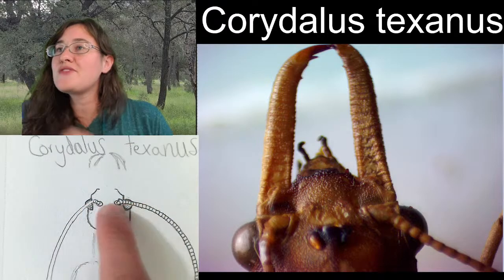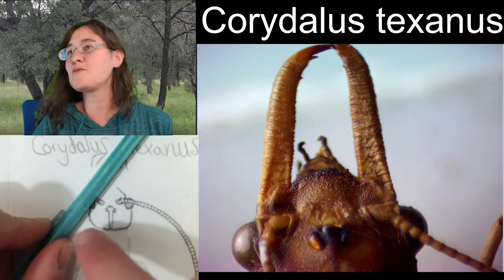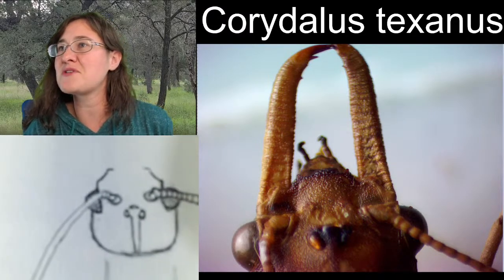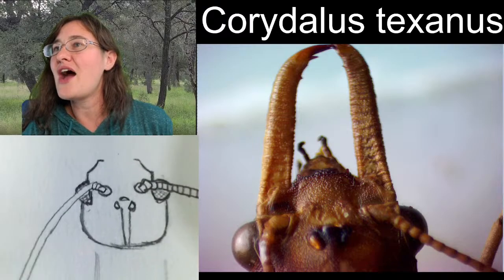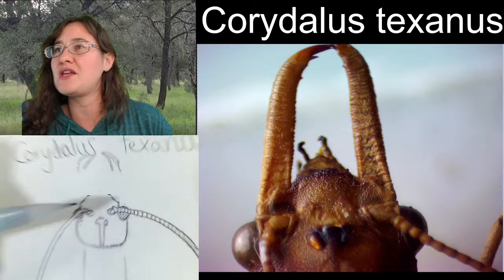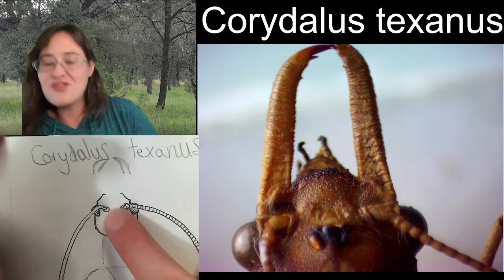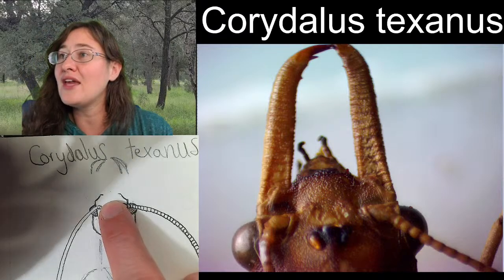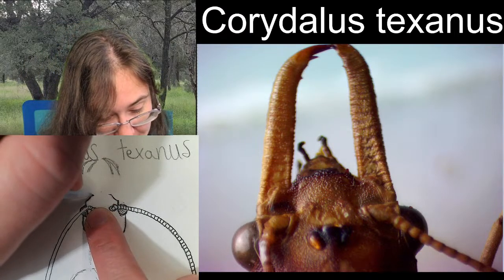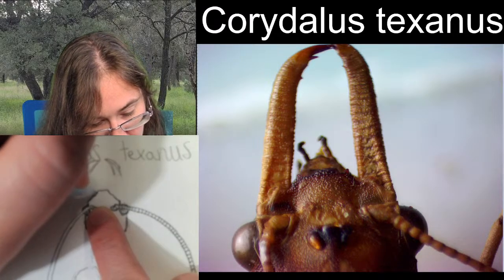Alright, so you want these lines to come angled in like this, but with a concave angle. So you can see, I don't know how much closer I can get. There we go. So this section right here, that's where the mandibles are going to be connected to. So we have those regions here that come up and in. And then from here, we want to bring it up to almost like a plateau.